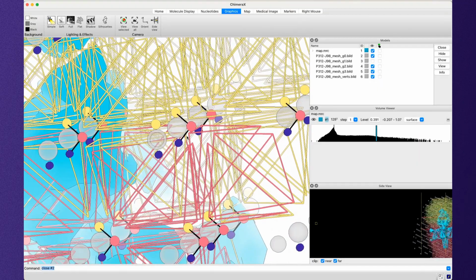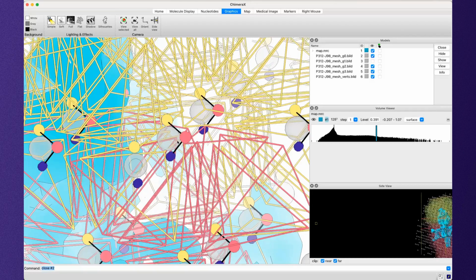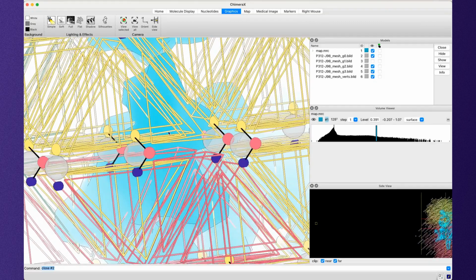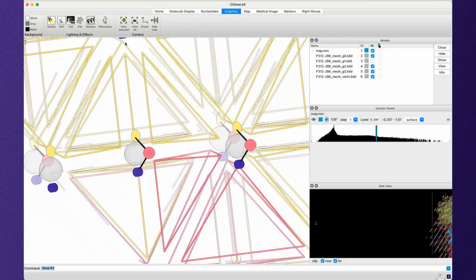So just to review, what we're looking at here is the yellow mesh, which in our case belongs to one of the fabs, and the pink mesh, which in our case belongs to the ion channel. And since we have fused those segments, they cannot move independently. Any vertex that is shared by both yellow and pink must move the same for both meshes. So for instance, if we look at this triangle here in the front view of our camera, if we want to move this tetra so that this vertex is closer toward the center of this tetrahedron, we necessarily must move the pink tetrahedra's vertex to be in the same position.